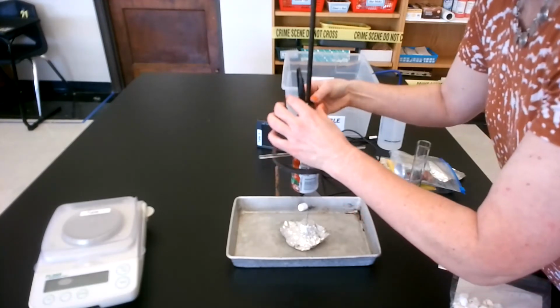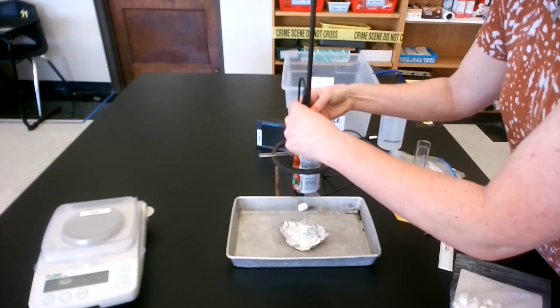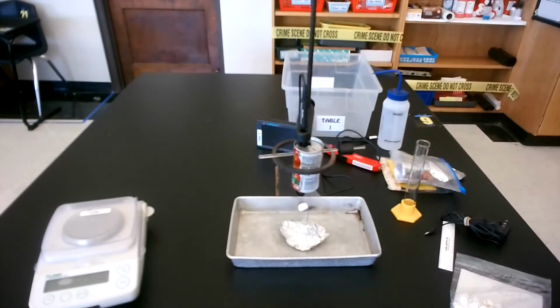So after my water's in there, what I do is I make sure I'm holding on to this, I go to the bottom, okay, and then I come up about 1/4 of an inch. Okay, so it's kind of hard to see.